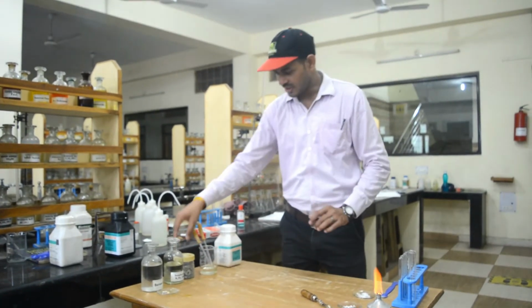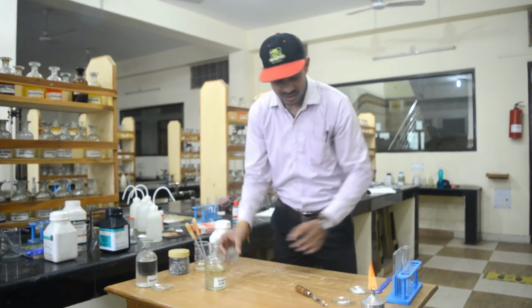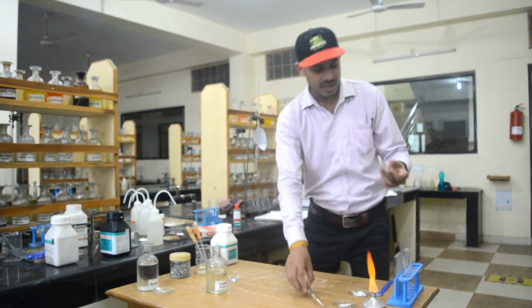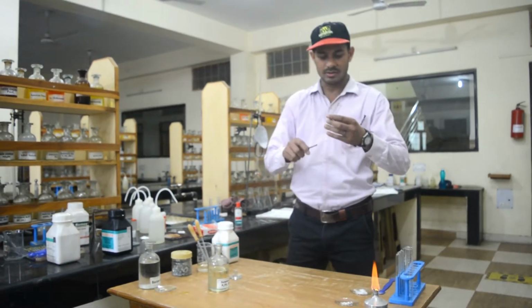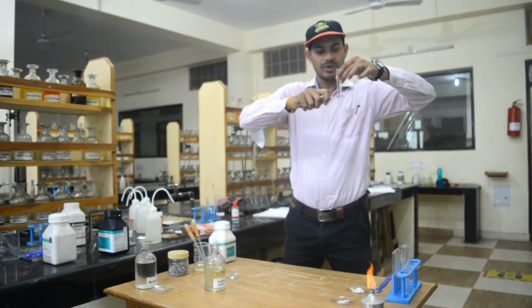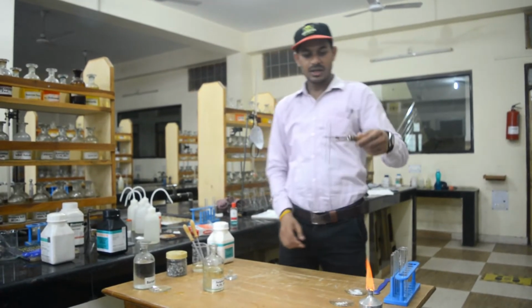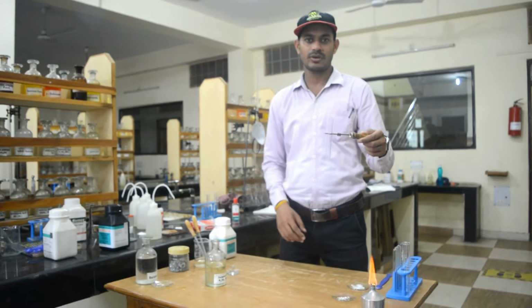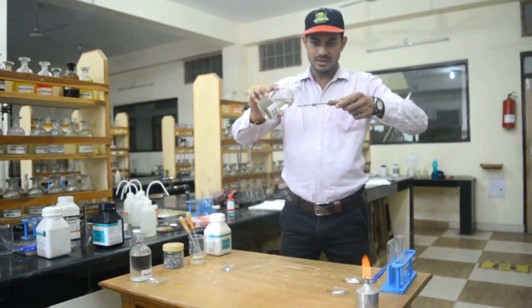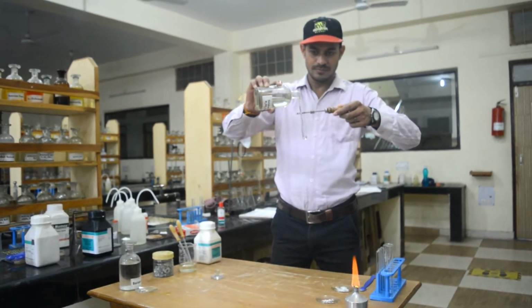Now the second experiment is the displacement reaction. For this, I will take sulfuric acid in a test tube. Take care whenever you are handling sulfuric acid: hold the test tube in the test tube stand or holder, because when we use the chemical, it can be harmful for our skin.